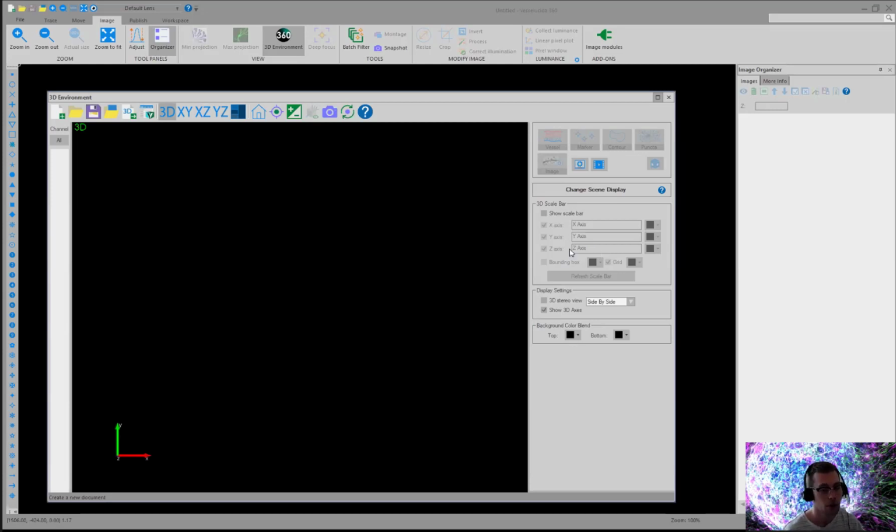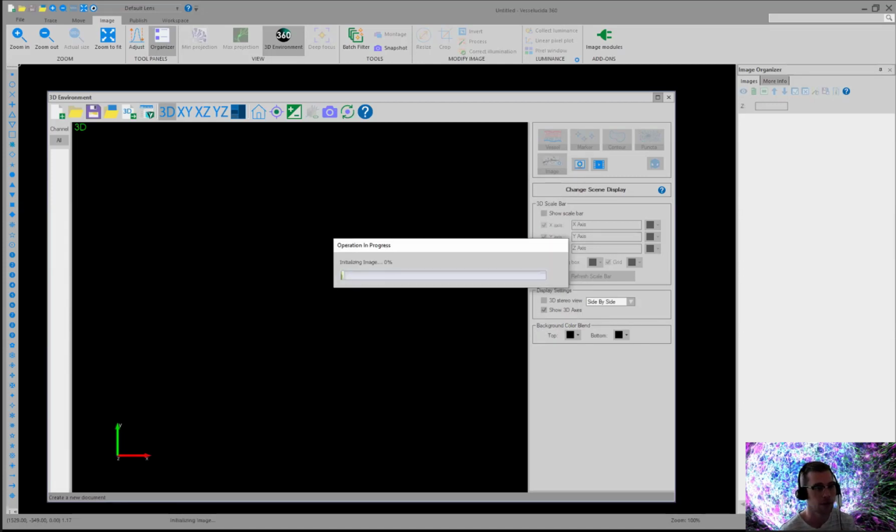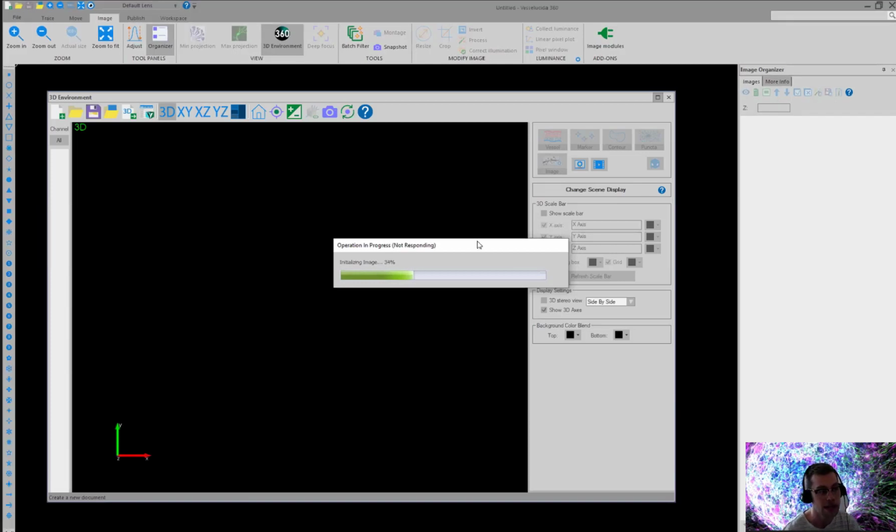We do work with small stacks like this. We can also work with 2D images that have stained vasculature, and we can go all the way up to full organs. So one example that I love to show is something that we received from one of our customers, Miguel Gama Sosa. I think he's in the webinar now. And I'm so excited to have permission to share this. This is from research that he had done a couple of years ago.